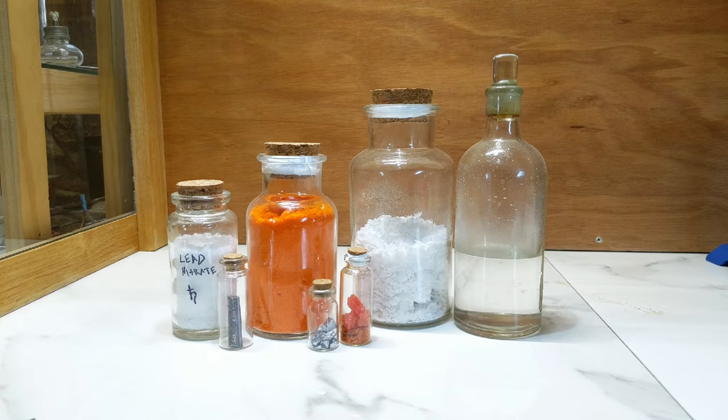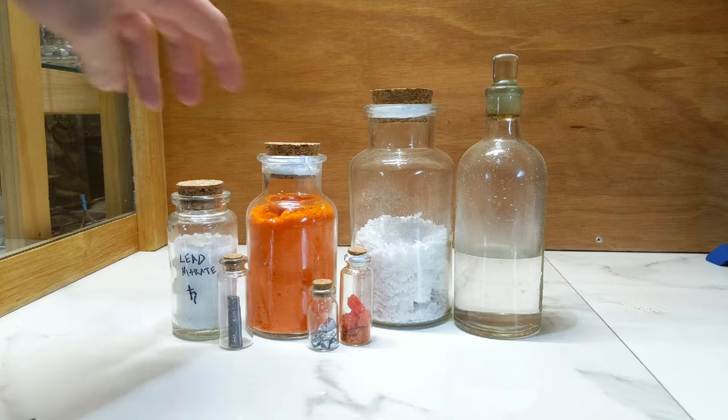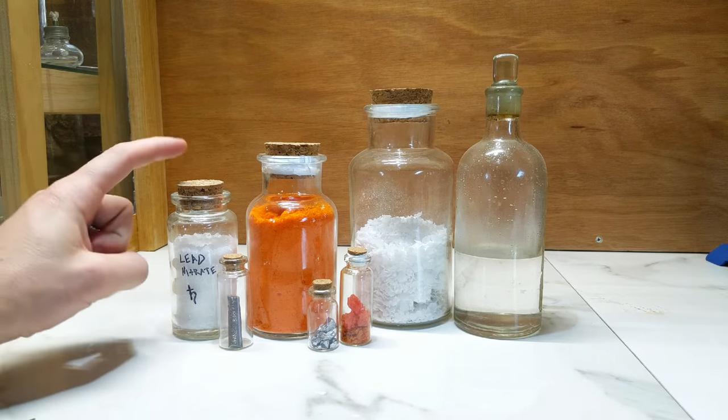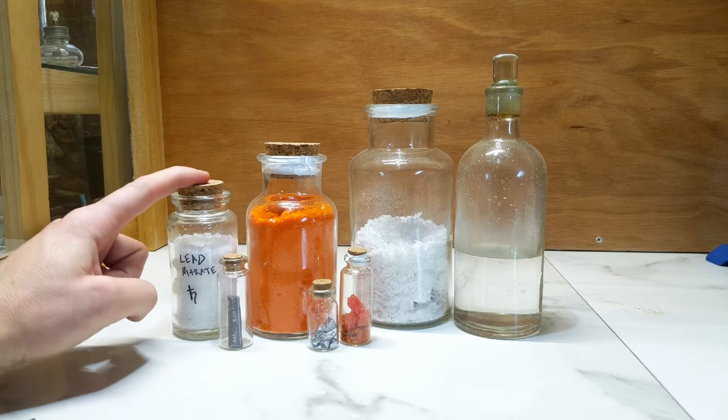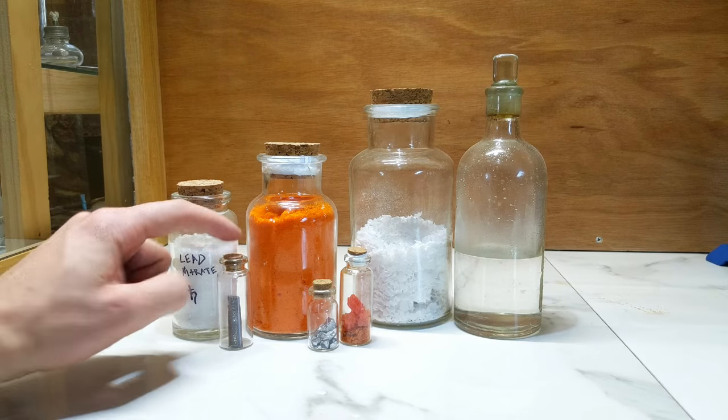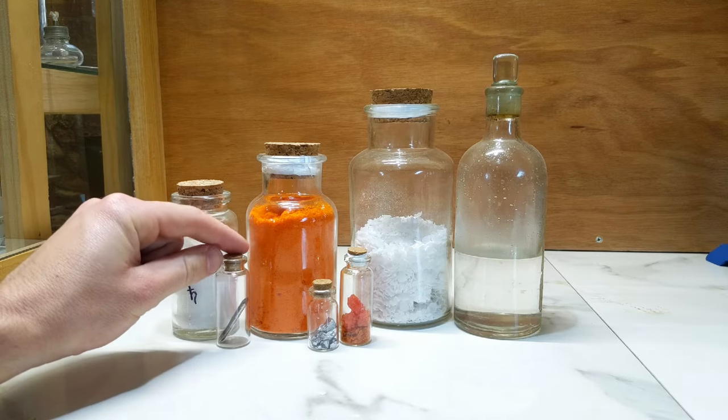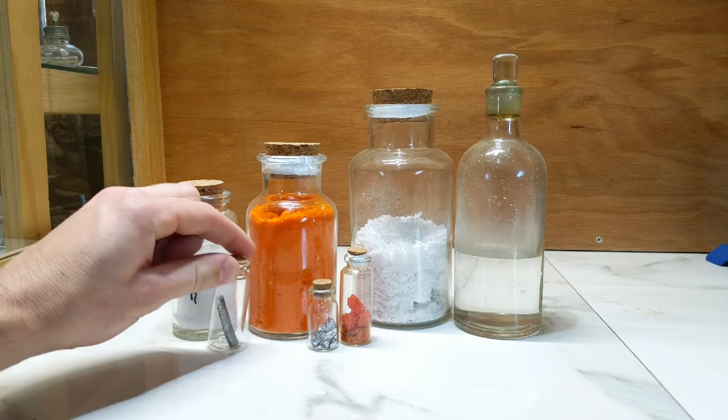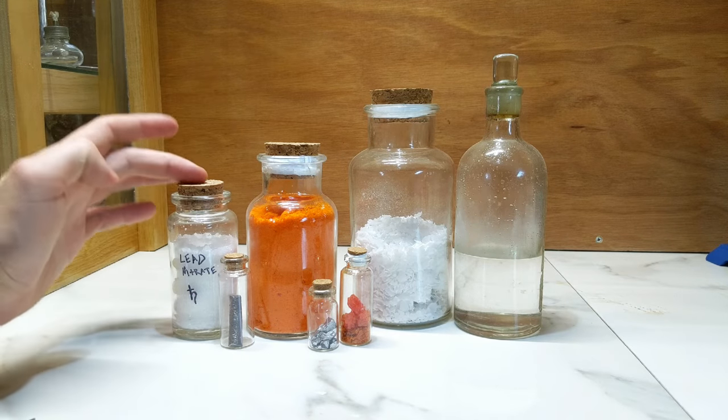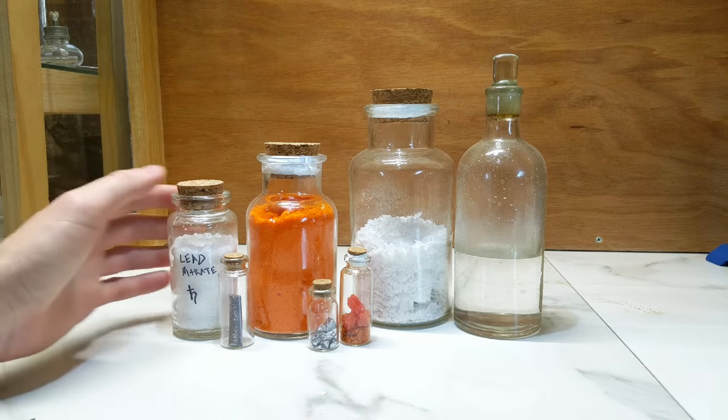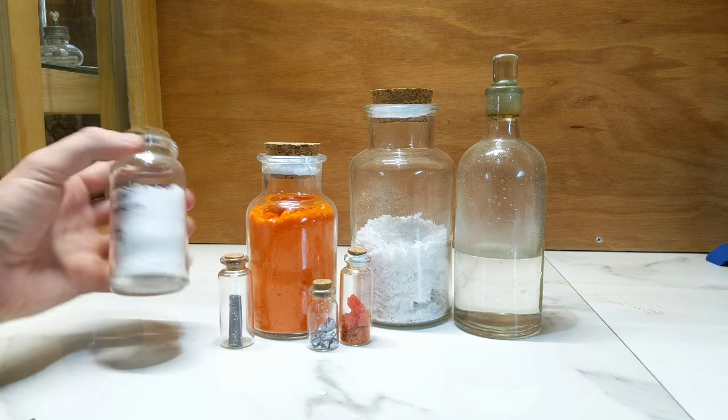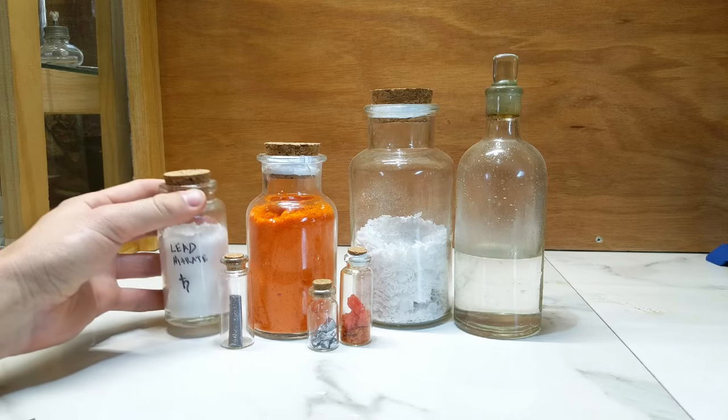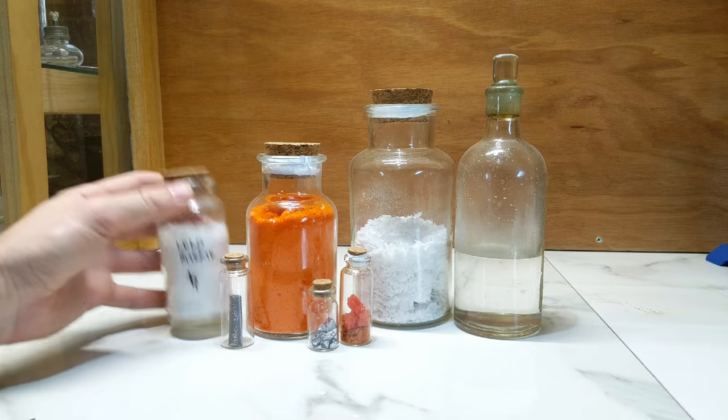The basic components of chrome yellow, or to get to what is called lead chromate, is to take lead nitrate, which is a nitrated salt of lead. In alchemical terms, we've taken the metal of Saturn and we've added aquafortis to it, and through that process we've created a crystalline salt called lead nitrate, which this jar is actually quite heavy despite its size.